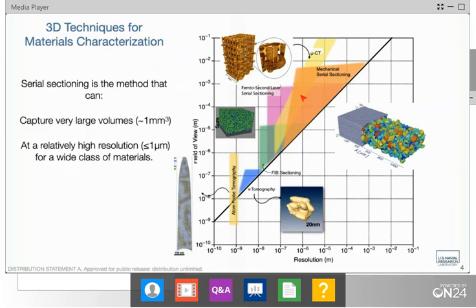And what I've plotted here is a rough estimate of your resolution versus your field of view. And this line that runs through it is this magic line of needing a resolution of 10 voxels per item. So it really doesn't make sense to have anything that exists within this domain. You're talking about just not having enough voxels within your field of view to resolve anything useful.